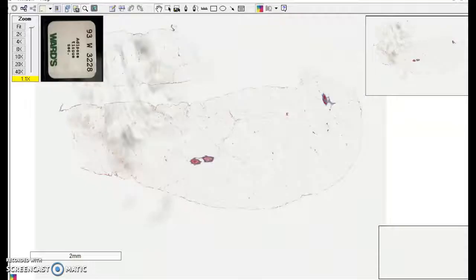Adipose. Adipose tissue often looks very pale on stained sections because most of what's there is fat, stored triglycerides, and those wash out in the process of fixing the tissue. So here's a typical sample. It has some blood vessels in the center, and those are surrounded by a large section of adipose tissue.